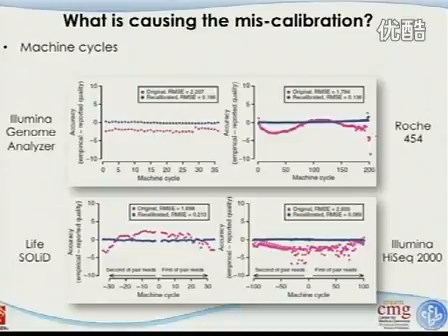All right. So for the HiSeq 2000, you can see this is the paired ends. So you can see this goes to both directions, and this is the beginning of the read and the end of the read, and this is across the board. The reported quality is kind of not as good as they reported. Does that make sense here?